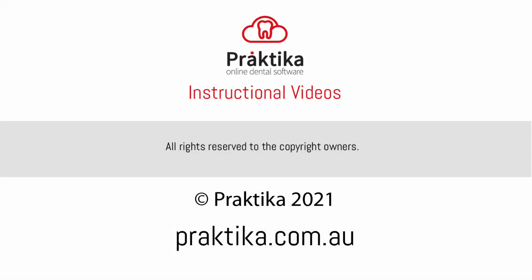This concludes part 1 of 2 of the Praktika's image module image adjustments. Thank you for your attention.